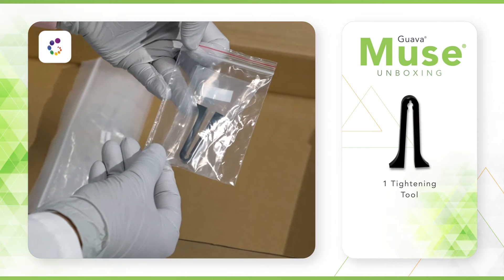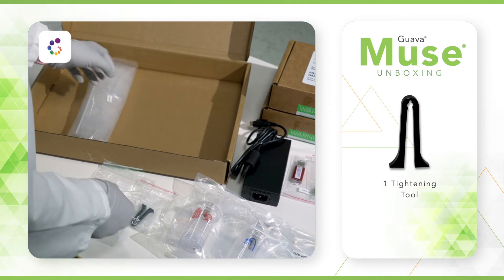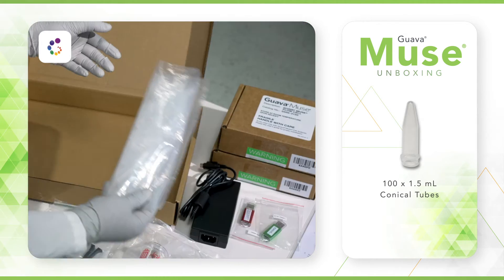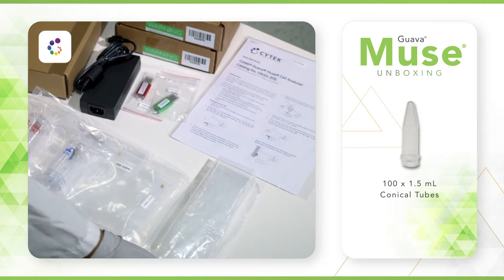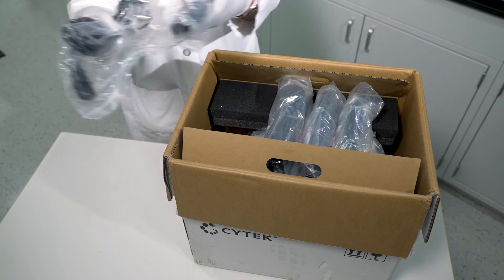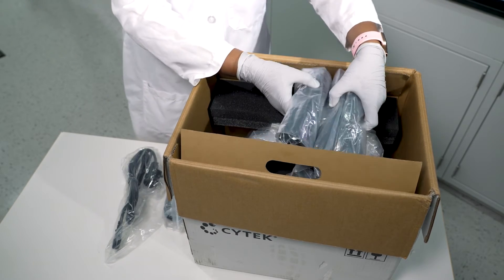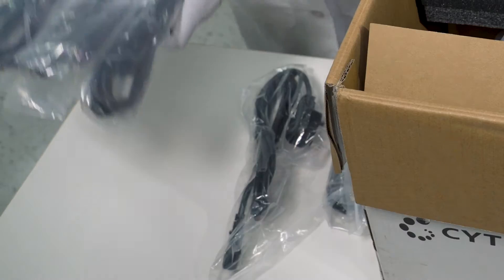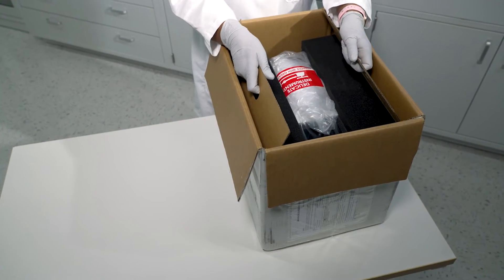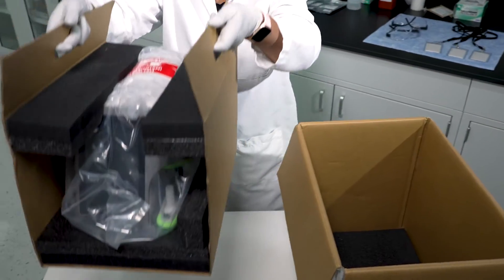The syringe tool is used for cleaning flow cells should they become blocked. The tightening tool is used to tighten the fittings on the bottle tubing and flow cell connection. 100 1.5-milliliter conical tubes are provided for general instrument use. You will find the country-specific cords just under the prepack box. Remove them all and set aside. Next, carefully remove the instrument from the box.